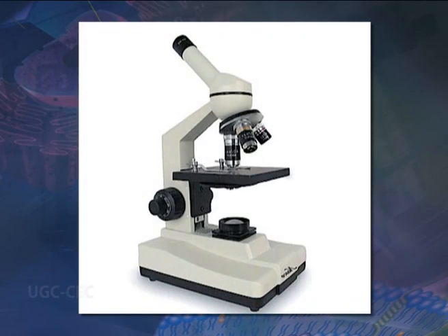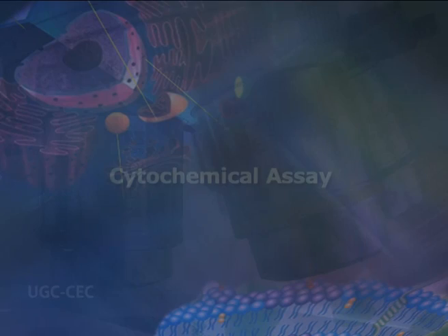After 2 rinses in filtered seawater, transfer the pellet for resuspension in the same medium to a final concentration of 10⁷ cells per ml. Place the freshly dissociated cells under a light microscope for morphological analysis. Analysis of cells stained with different cytochemical dyes occurs under the same light microscope.